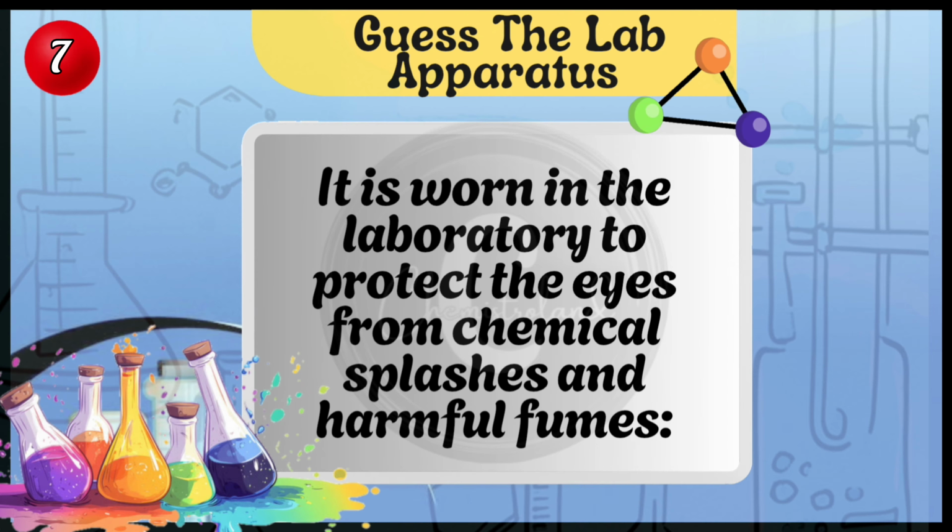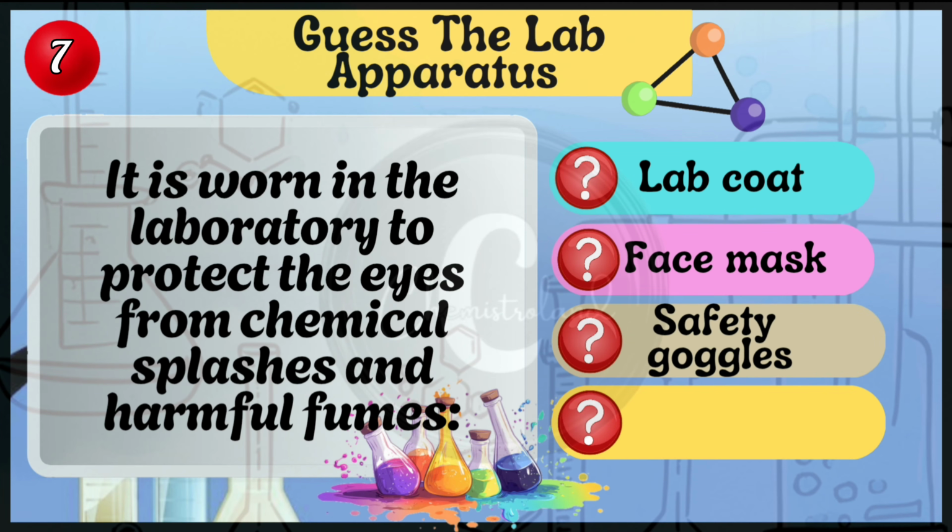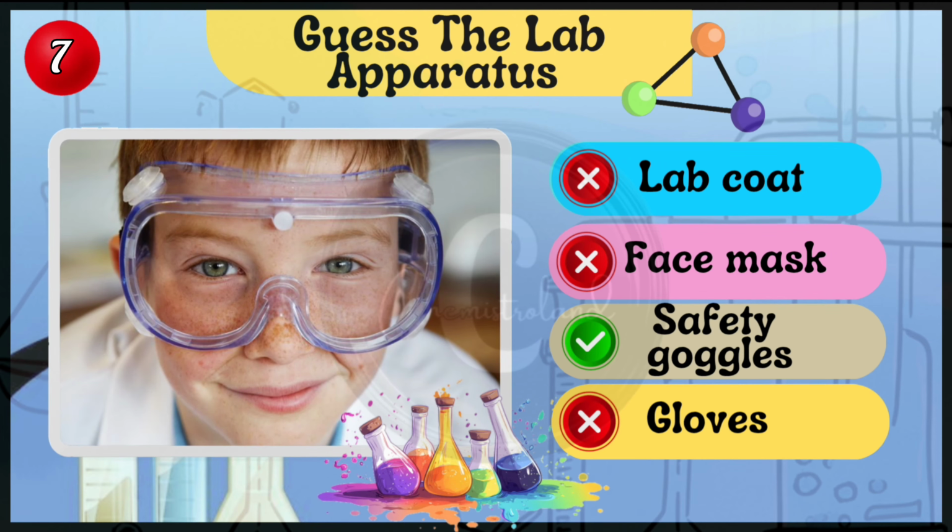It is worn in the laboratory to protect the eyes from chemical splashes and harmful fumes. Lab coat, face mask, safety goggles, or gloves. Safety goggles.